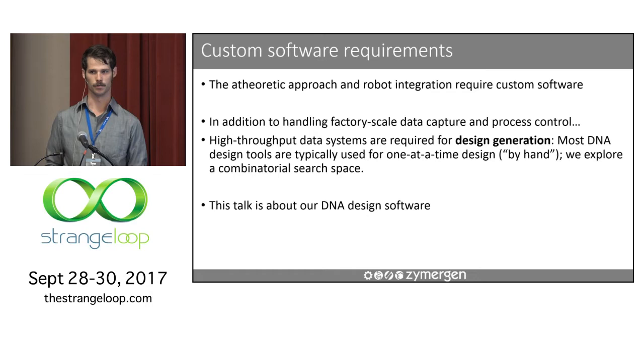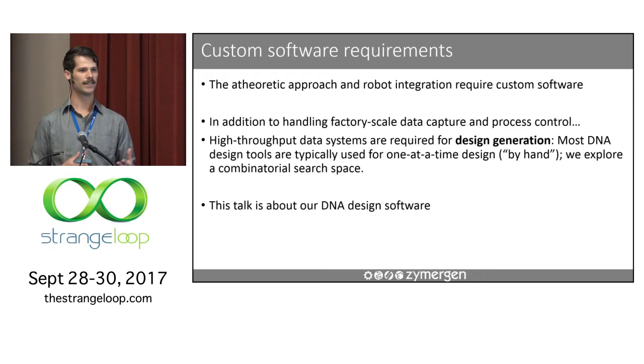Most of these existing tools really focus on building single designs at a time, search spaces of size one, if you will. This problem reinforces the idea that a scientist will be making a single hypothesis at a time and then testing it with that one change, then going back and trying again. So we have a need to overcome this and design very large search spaces in very little time and space. So this talk will now shift to how we solved this problem.